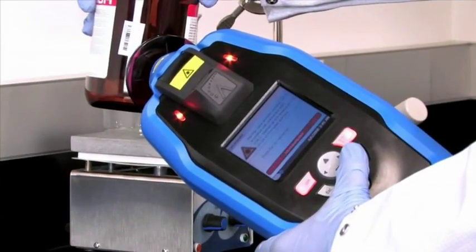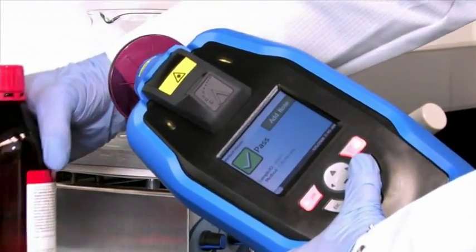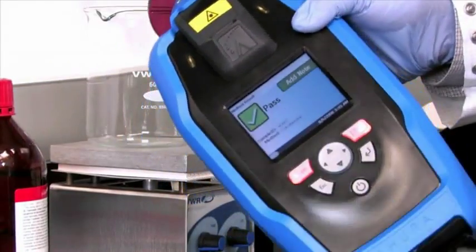TruScan quickly analyzes the substance in question and provides an immediate decision on its validity, typically within 30 seconds.